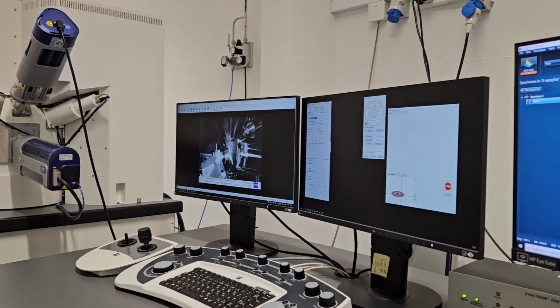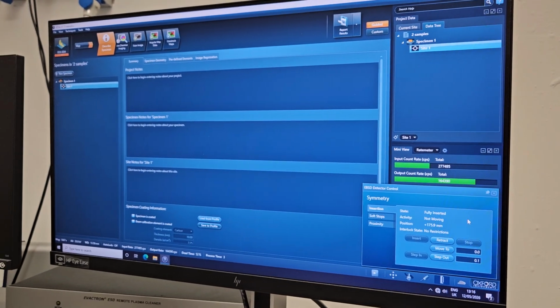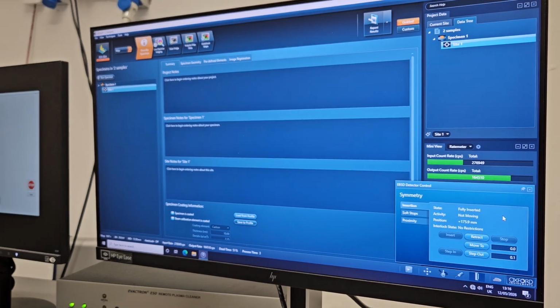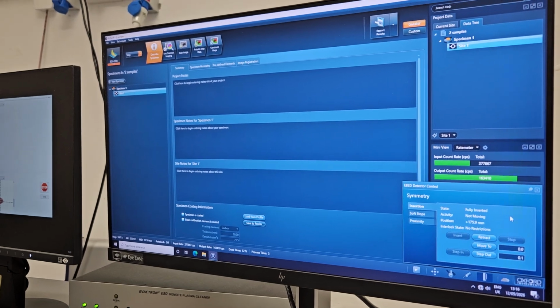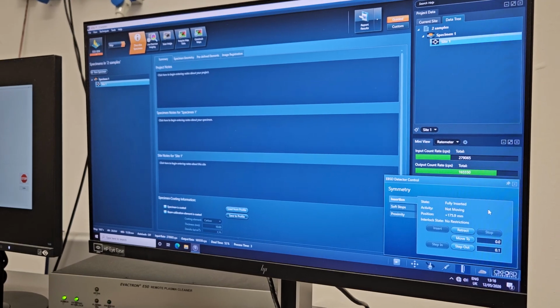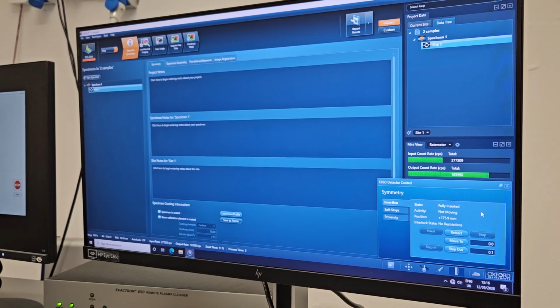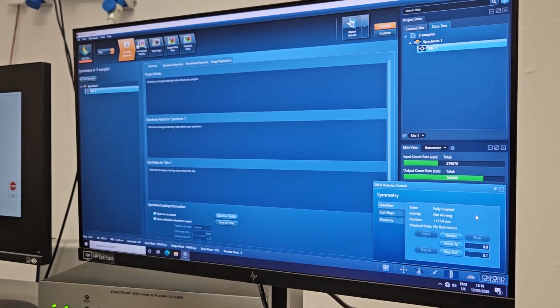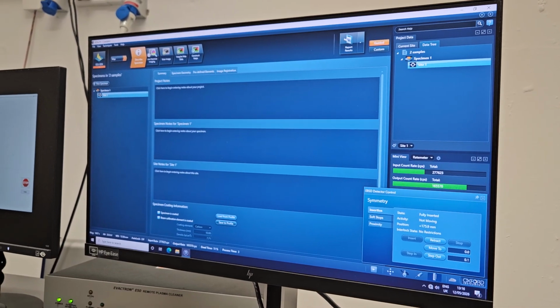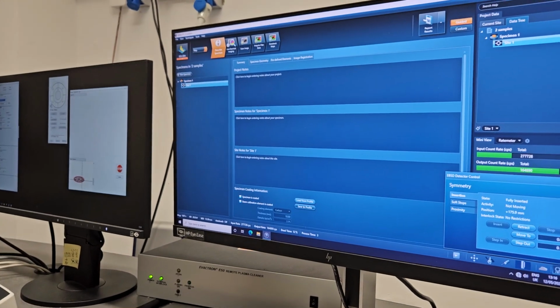The sensor did not activate because the sensor didn't think that it was dangerous. But you never know. So always watch what happens there and be ready to stop if you see that it's a tiny distance and it's still moving, and it's still far away from 175.9. So then it's dangerous. Better stop before you damage the detector. If you damage the detector, you will be famous at DTU Construct. People will remember your name.